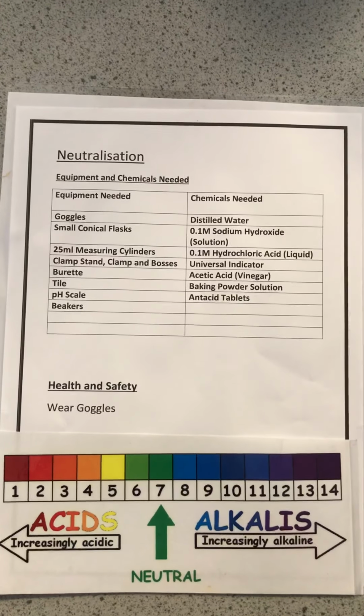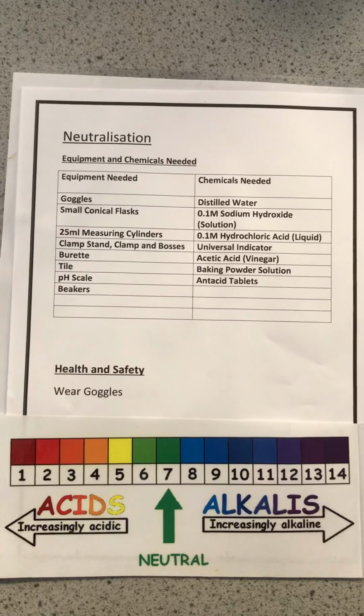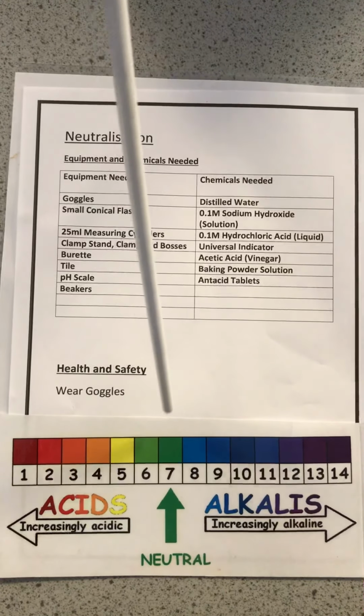In this video, we will be showing you various neutralization reactions. In a neutralization reaction, an acid is added to an alkali or a base to make salt and water, which is a neutral solution of pH 7.